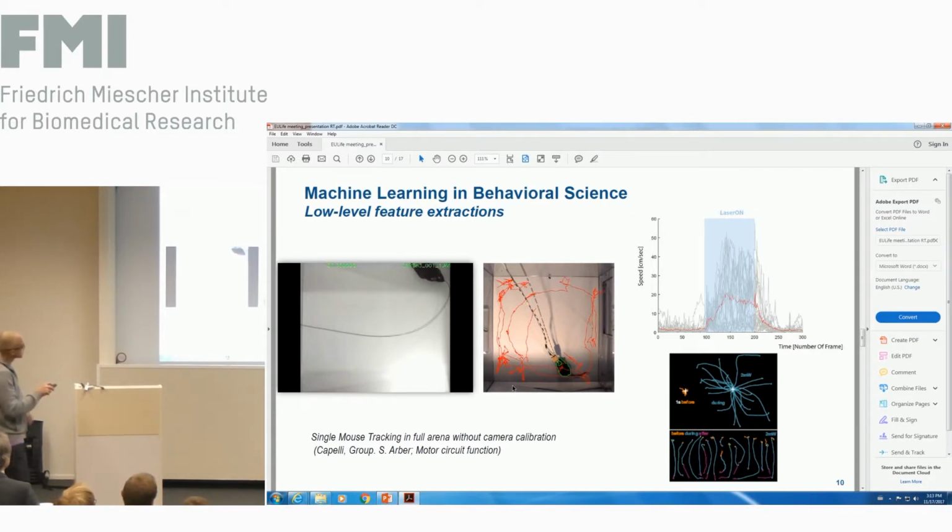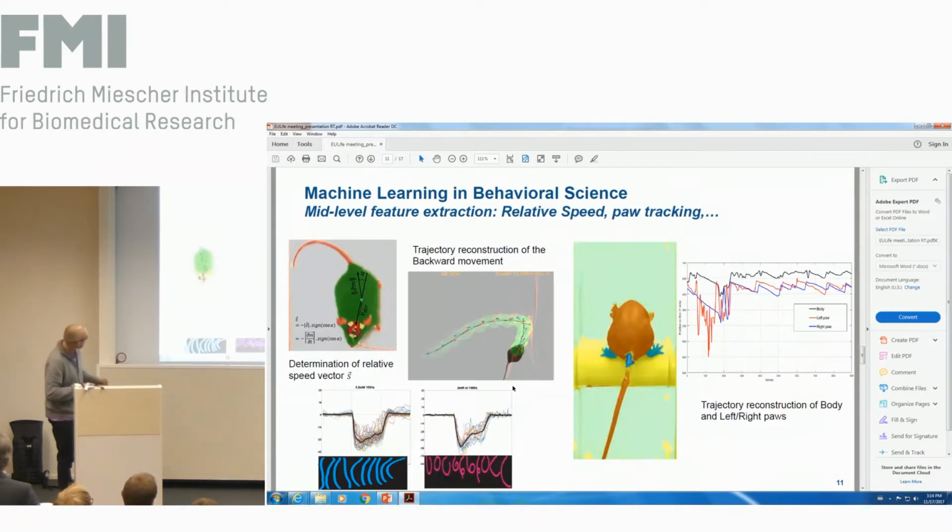You can even work with the different trajectories and look at what is happening before the laser on, and during. During would be this long blue line, meaning that he's really activating his motility. And then you have some latency afterwards. So this gives you quite a rich door to analyzing all the data that you might get out of that.